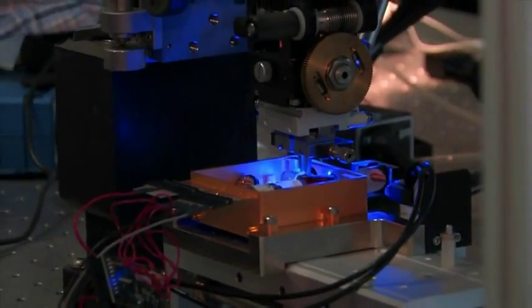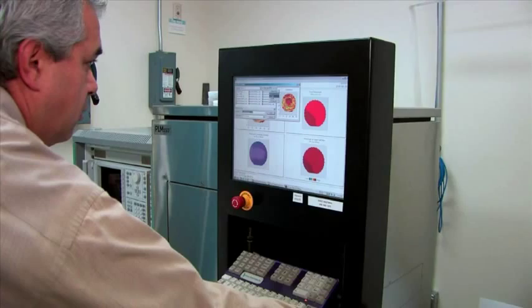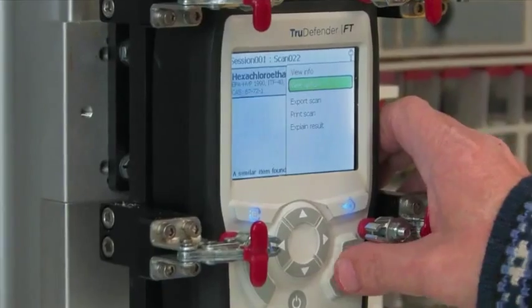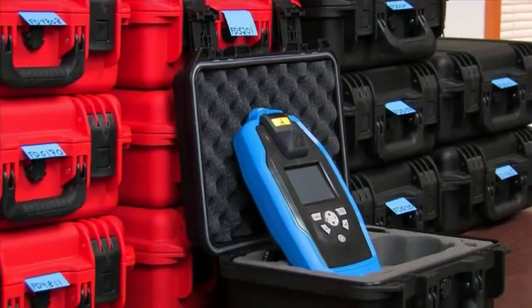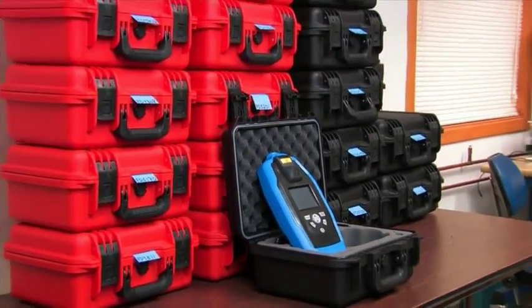Our expertise in the miniaturization of lasers, probes and spectrometers, combined with our advanced algorithms for chemical identification, has enabled us to bring to market an exciting new class of portable analytical instruments.